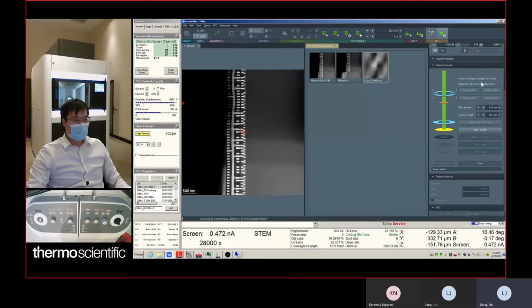Start recording. So we're going to go to the 10 degree. It's still about the same. You see it counts about 9, 10, 6. It's changing, right? It depends on the location. So that's quite similar, right? Then we can stop.